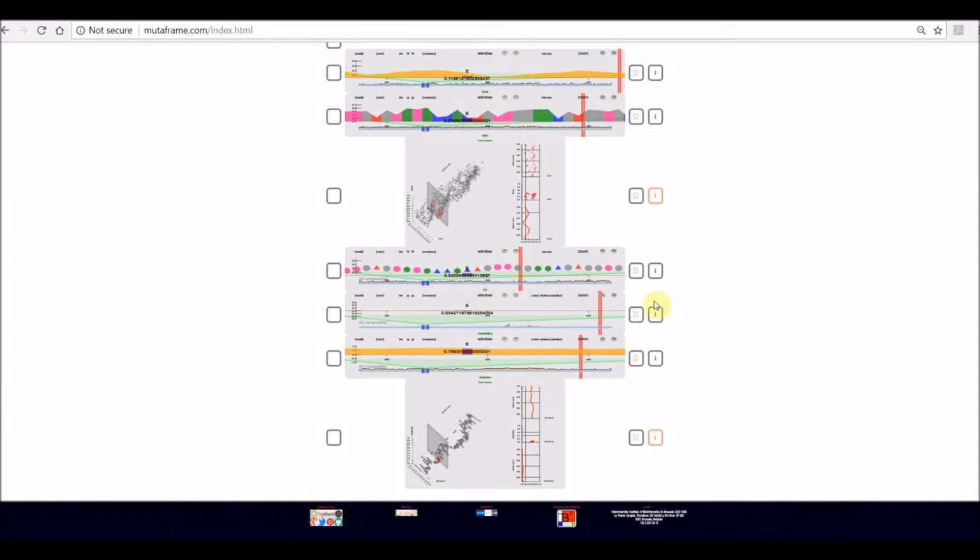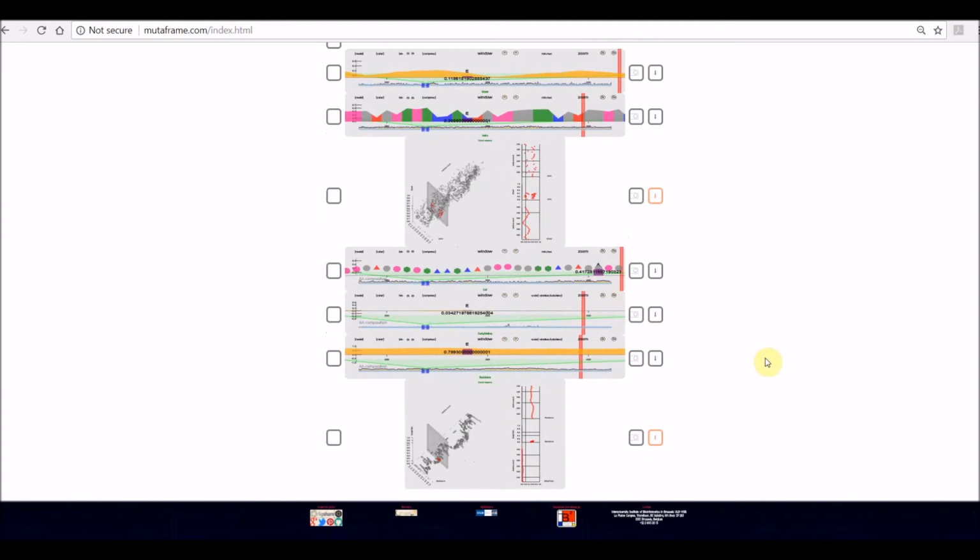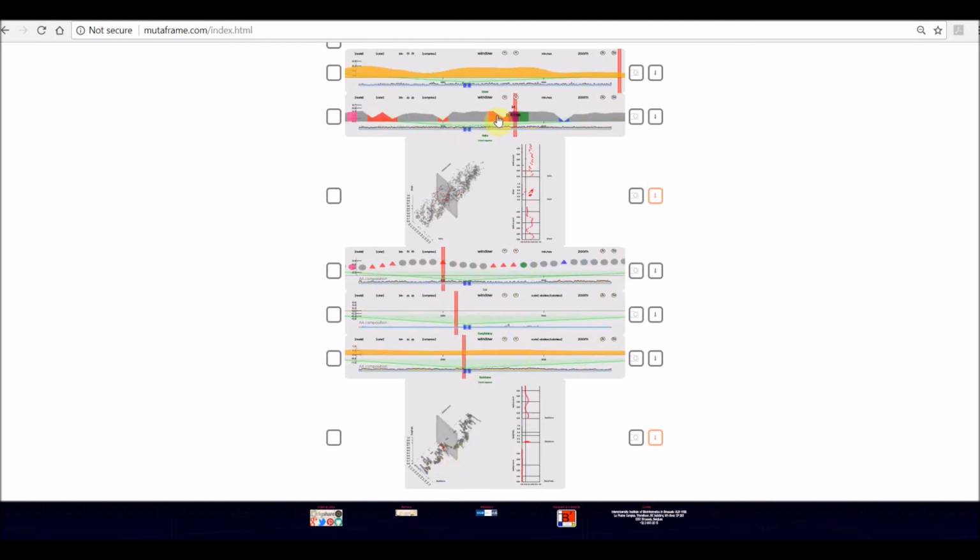Obviously, there are a lot of issues, like I need to round these numbers and maybe work a bit more on the UX, but the premise of components that can be synchronized with each other, I think, is a strong one, and there's a lot of material to build on it. Not every drag gesture here is throttled, so you might have performance problems. You might not have as high FPS as you would expect, but I will throttle these drag functions in the upcoming versions. But still, you will get a steady at least 30-40 frames per second in Chrome, even when you have like 10-15 applets all running at the same time.